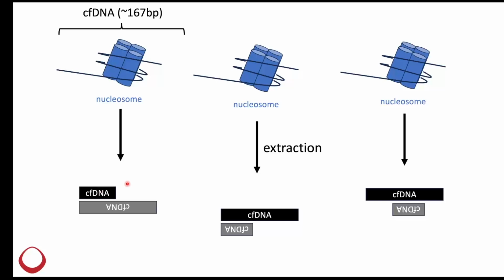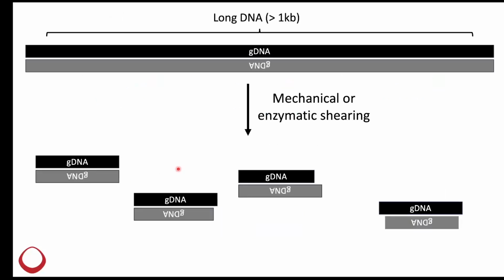More recessed ends on either the 5' or 3' end. So most NGS library prep sequencing workflows that involve a ligation method include an end repair step. And the goal here is simple: convert all fragments into clean, blunt molecules such that Taq polymerase can add its A tail and the adapters can ligate efficiently through a TA ligation strategy.